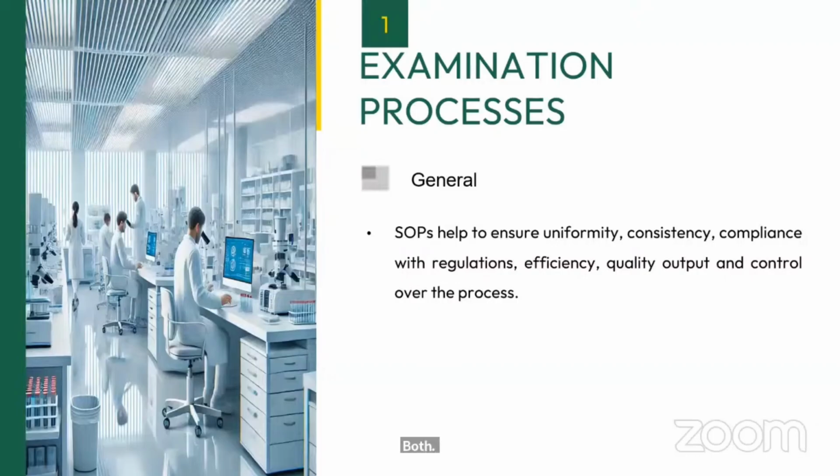Not every time do you have to go and read those SOPs, or need to have your own separate protocol. That will create a lot of confusion, and it may decrease the overall efficiency of the laboratory. So to have a quality output and an efficient working condition, you must have an appropriate standard operating procedure, and you will have control over the process.